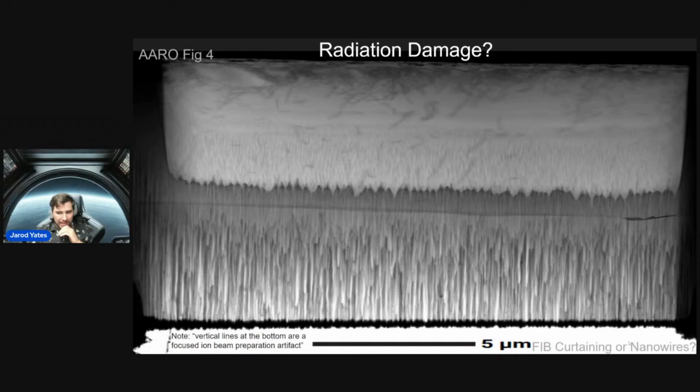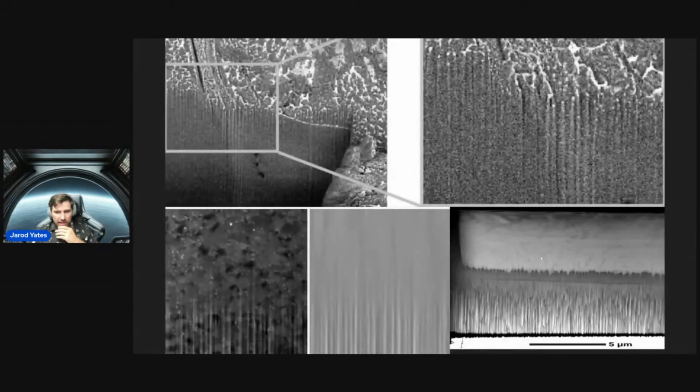However, I like entertaining ideas. So the idea that it might not necessarily be curtaining, keep that in mind. So here's some images of what curtaining looks like. And yeah, I can see the relationship between that and this, but there's enough variation between this and this that it just makes me wonder.